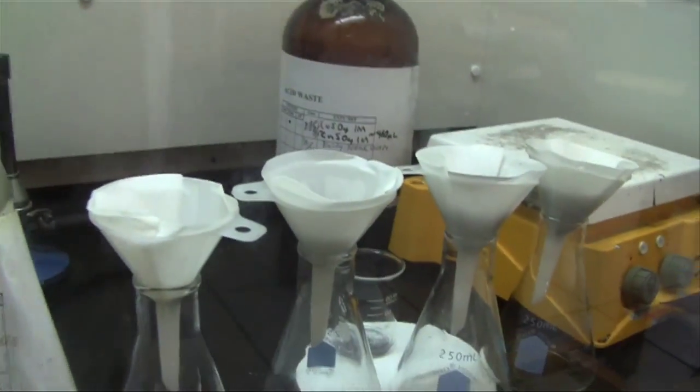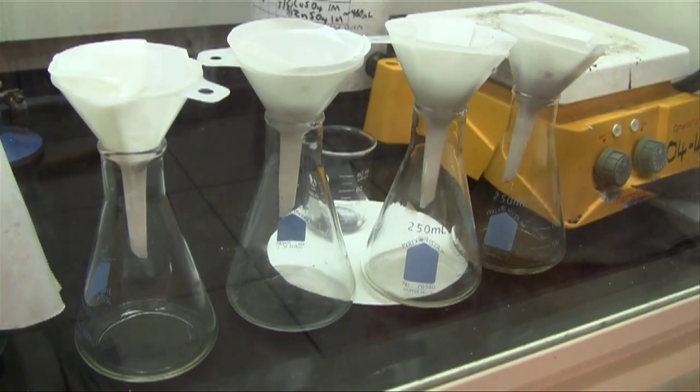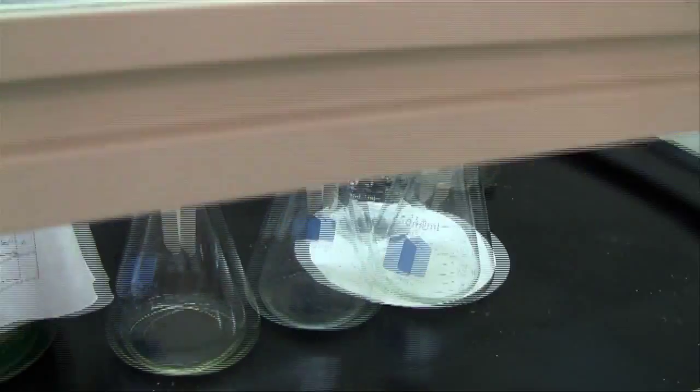We will mix each of the iron 2 chloride solutions to its corresponding concentration of iron 3 chloride. Our hypothesis is that the greater the concentration of the two iron chlorides, the stronger its magnetic strength.